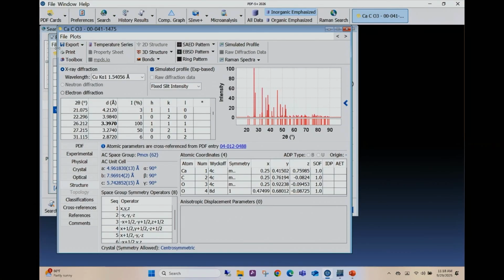And what you're going to find is in the web version that you're going to use, it does not have this export function. And the reason is we taught a class overseas in another country, and a couple people thought that the export function meant that they could try to download the whole database. Okay, and that's not the intent. But if you purchase the database, you don't need to download it.